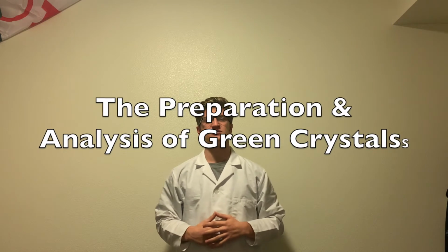Hello and welcome to the Chemistry 111 TED Talk and explanation video of the preparation and analysis of potassium trioxalatoferrate(III) trihydrate crystals, also known as our green crystals for our green crystal lab. In order to be successful for this experiment, we're going to require a few key pieces of equipment.